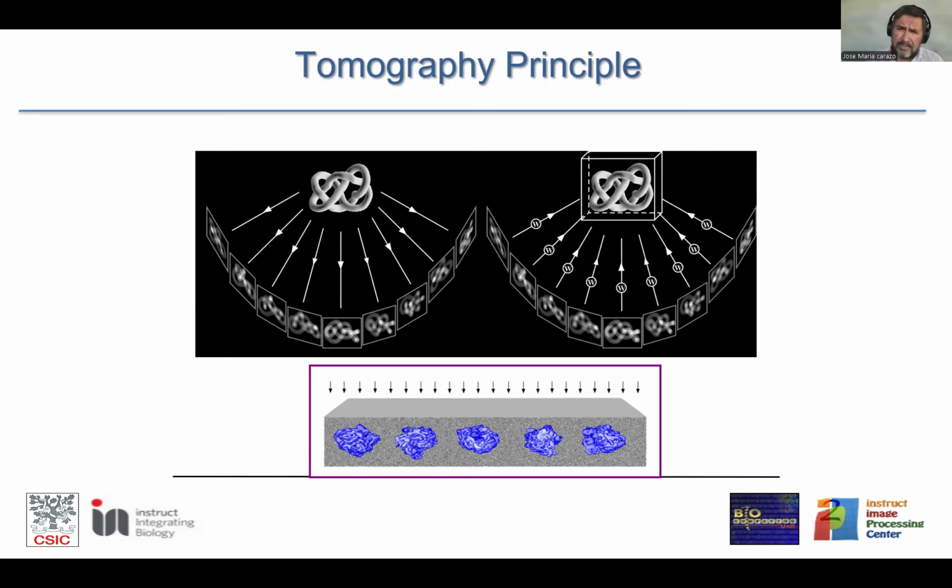Maybe you are missing many complexes that did exist. Certainly, you do not know the relationship between complexes because you purify A or you purify B or C, but not everything at the same time. So the area of tomography is perhaps the next big frontier in the field of CryoEM, and we are also working in that part.